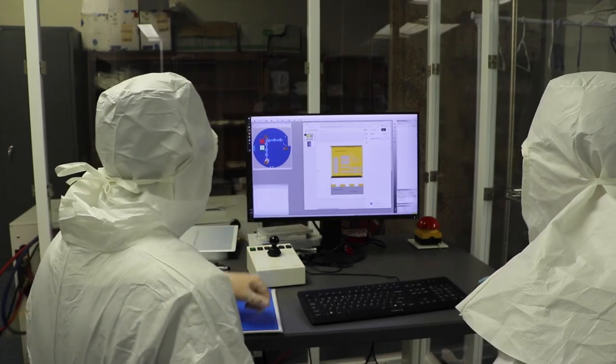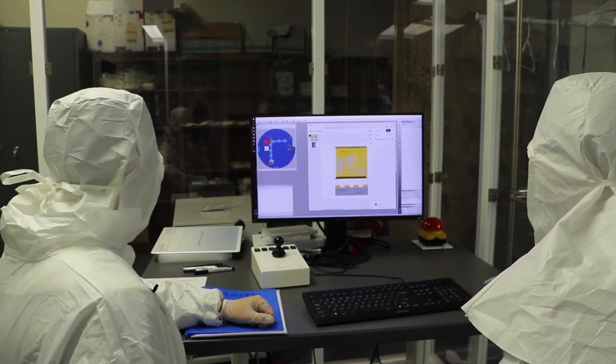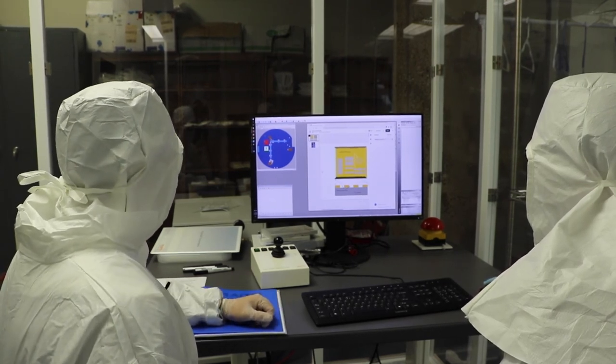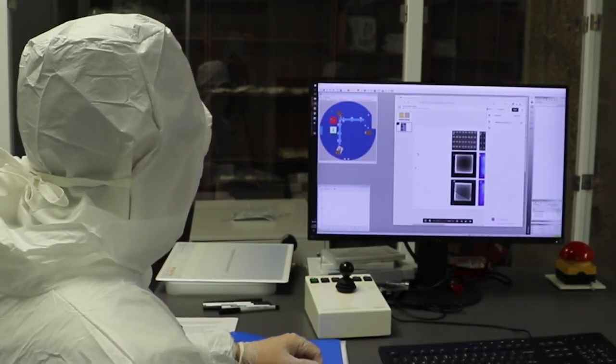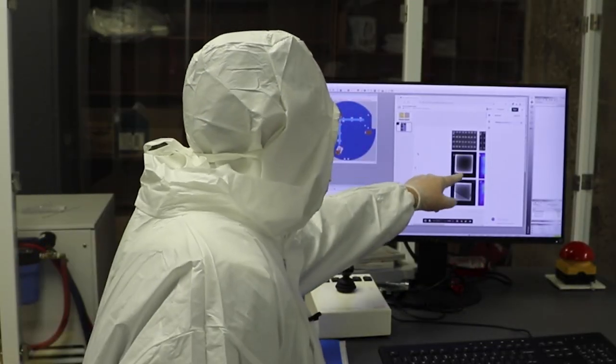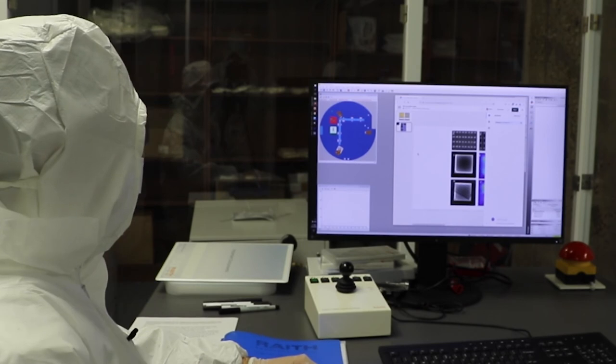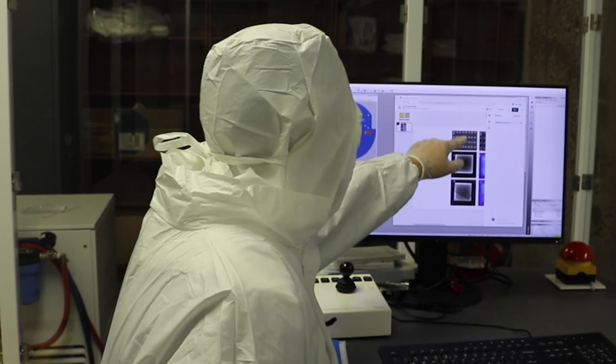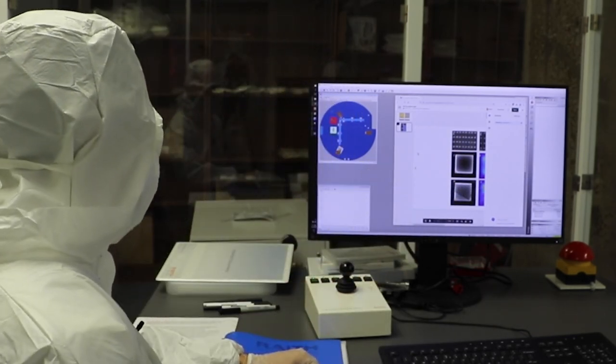To image the patterns, the sample is inserted into the microscope again and an image is taken with the scanning electron microscope. The scanning electron microscope uses the electron beam to image the surface of the material and then you can see the structures that we just milled with the e-beam lithography system.